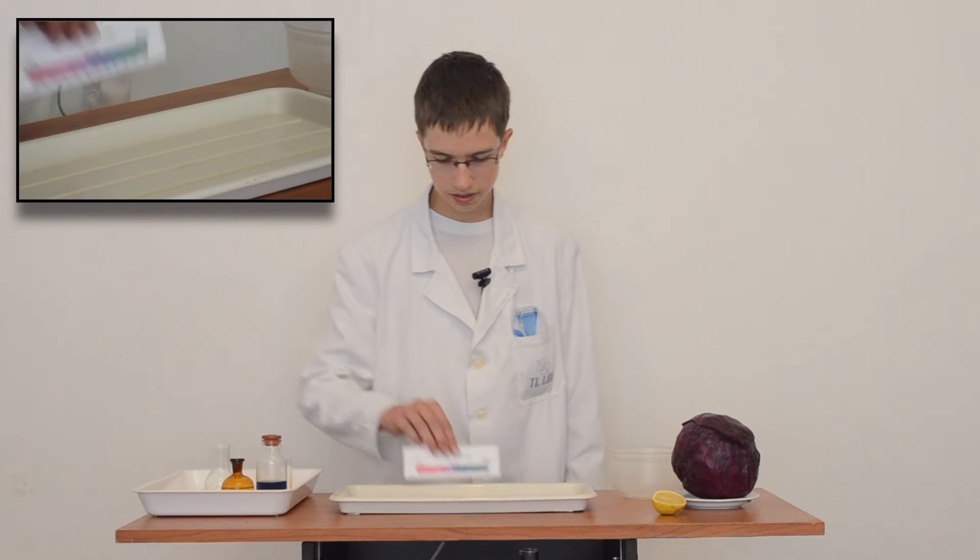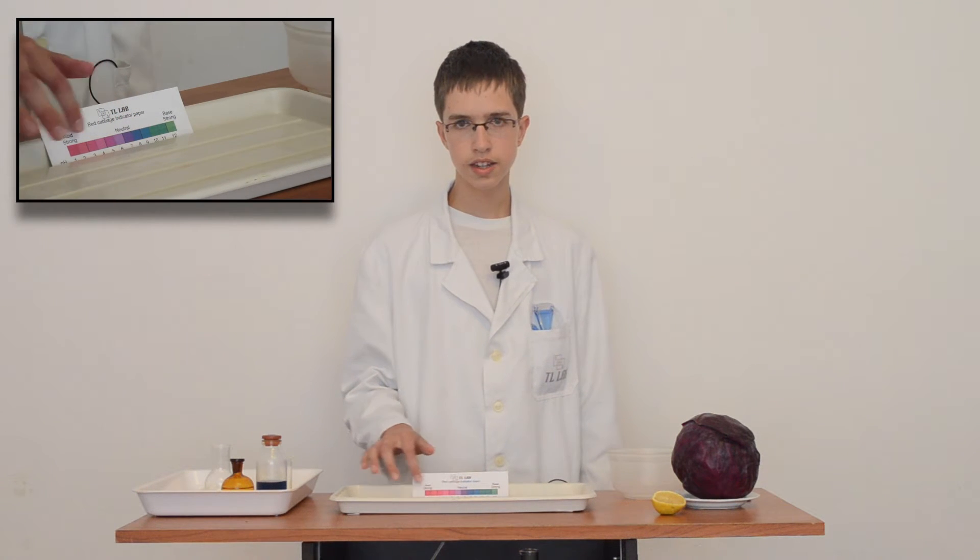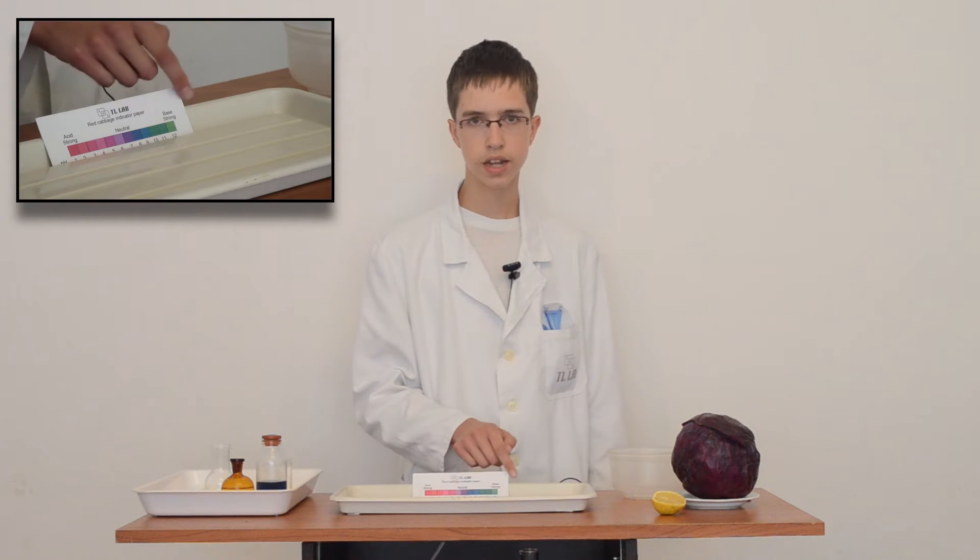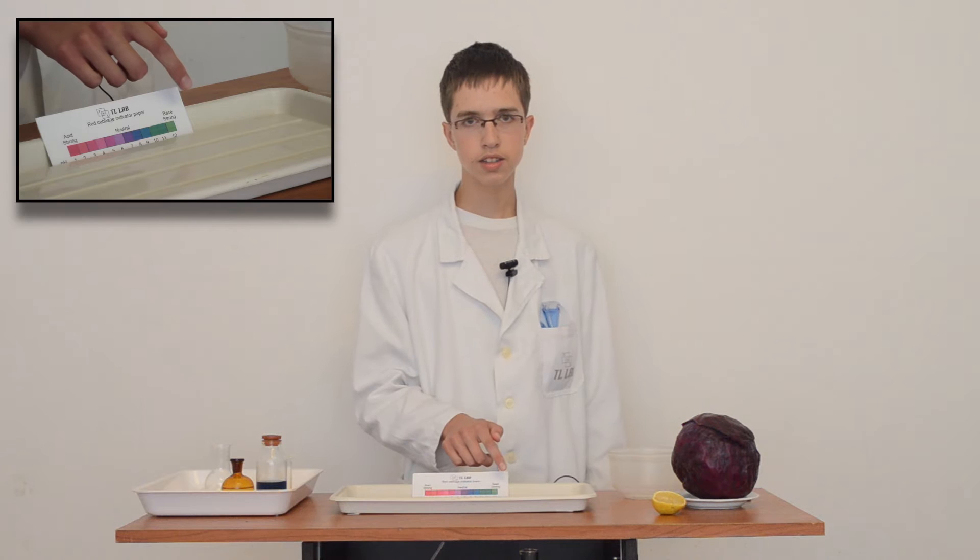Results of indicator changes we compare with indicator paper where we can read if it is acid or base and how strong it is. The scale in which we measure base or acid is shown in pH value, where 7 is neutral, below 7 is acid, and above 7 is base. On 1 is strongest acid and on 14 is strongest base.